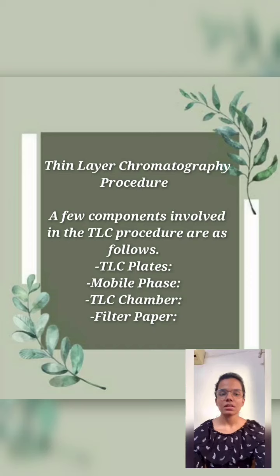TLC plates. These are used for applying the thin layer of stationary phase. They are inert or stable in nature. The layer of stationary phase is kept even throughout these plates for better analysis. Usually, ready-to-use plates are preferred by the people conducting experiments.